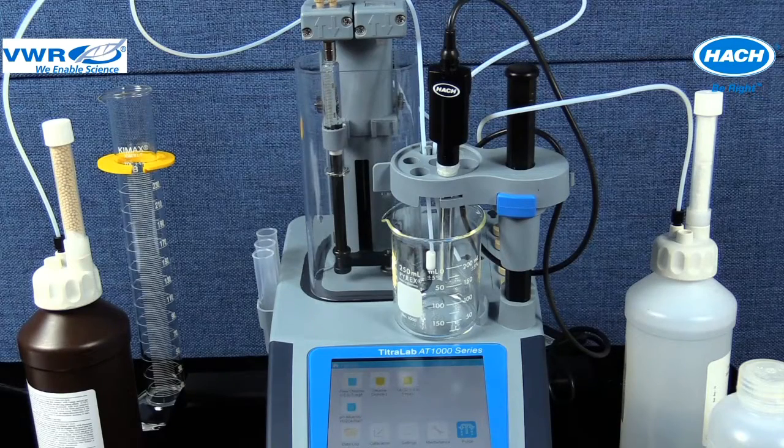It is recommended to purge the tubing from the syringe and the pump at the start of each day's titrations. If changing syringes, applications, titrants, or reagents, performing a purge is also recommended. This purge procedure clears air bubbles from the tubing and the syringe, replaces old solution with fresh solutions, and reduces cross-contamination from different titrants and reagents. The purge function is located on the home screen under the purge icon.